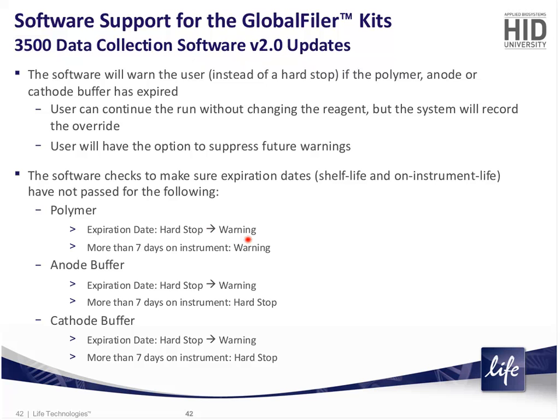Now, obviously, we don't recommend laboratories to utilize expired reagents because for operational reasons, validating with in-date reagents gives you the best quality data, but we do appreciate that if laboratories do have reagents left over, either from a large order and they wish to use it for training or for research purposes, then obviously it does allow them to have just that little bit more flexibility.